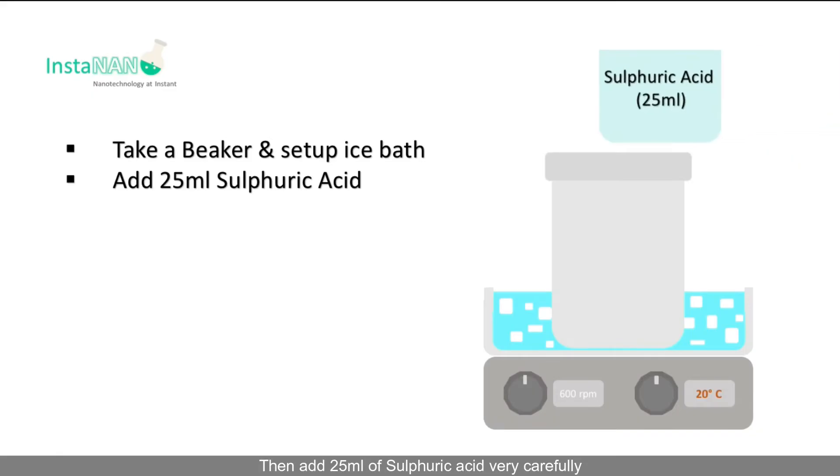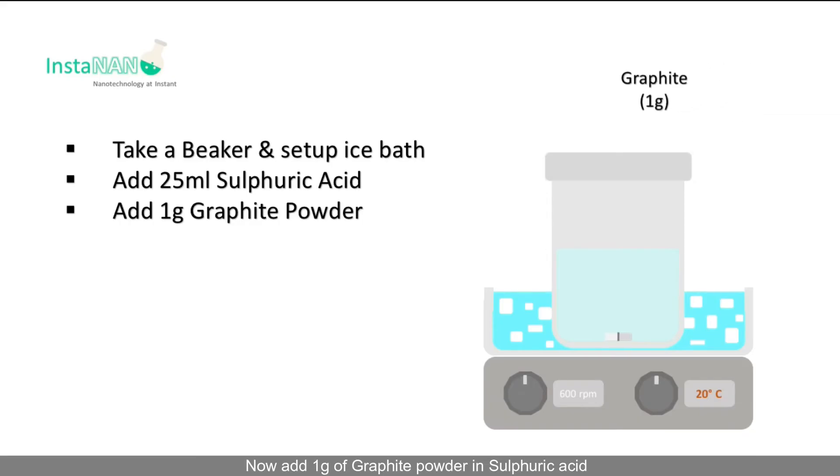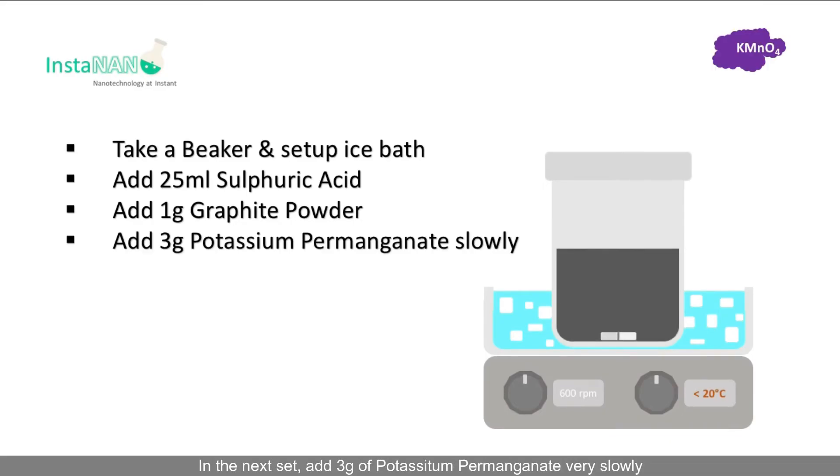Now put the beaker on the magnetic stirrer and set up the ice bath. Then add 25 ml of sulfuric acid very carefully. Now add 1 gram of graphite powder to the sulfuric acid — the solution will turn black because of the graphite powder.